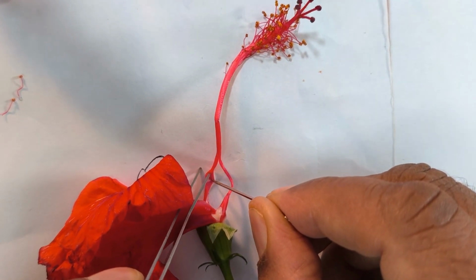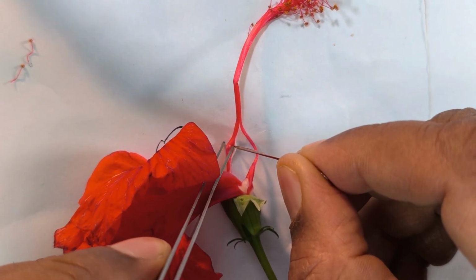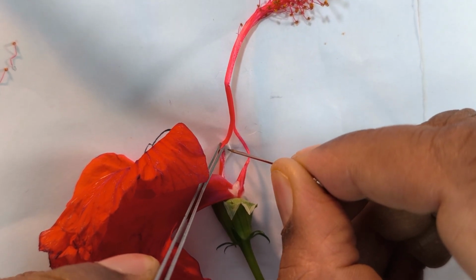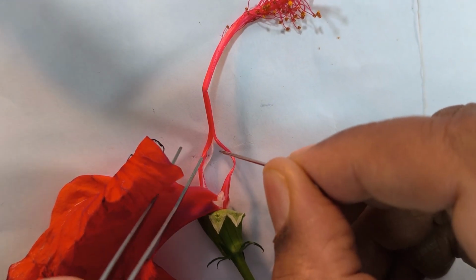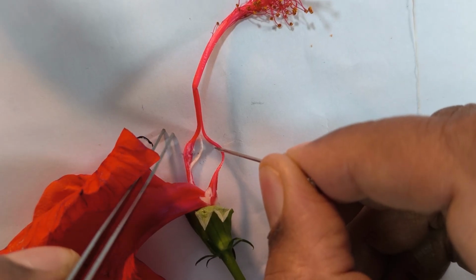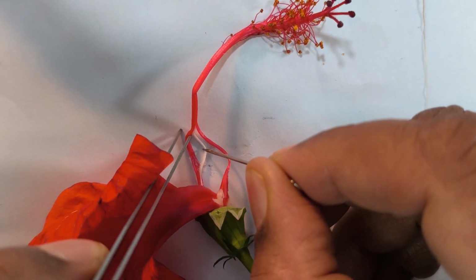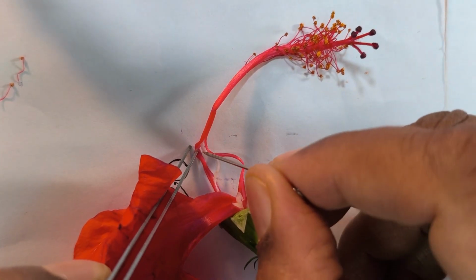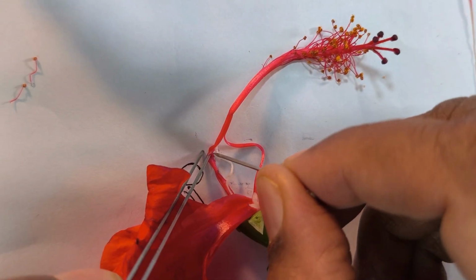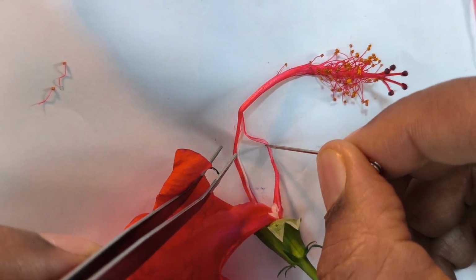You can see a white structure coming out. Yes, at the center you can find a white structure.